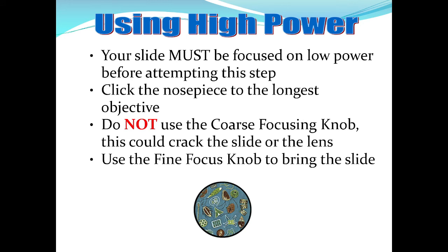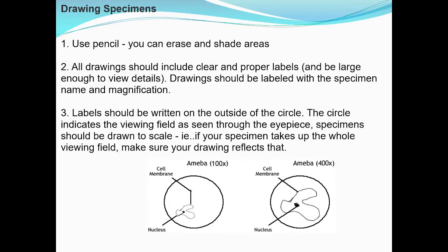When we're using high power, your slide must be focused on low power before attempting this step. Click the nose piece to the longest objective. Don't use the coarse focusing knob. This could actually crack the slide or the lens itself. Use the fine focus knob to bring the slide into focus.